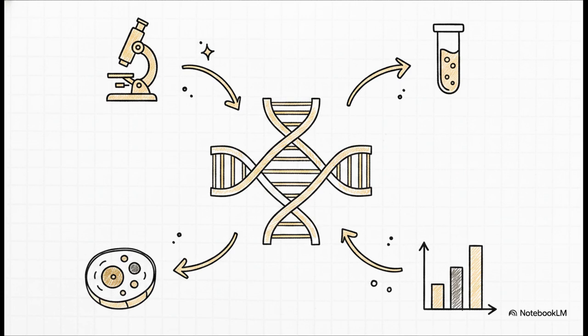Now, even though this was originally built with differential proteomics in mind, its applications are actually quite broad. Because the workflow accepts any curated list of human gene symbols, it's just as effective for RNA-seq data, biomarker interpretation, and broader functional genomics studies. And a nice bonus? It doesn't even require both up- and down-regulated proteins to function properly.